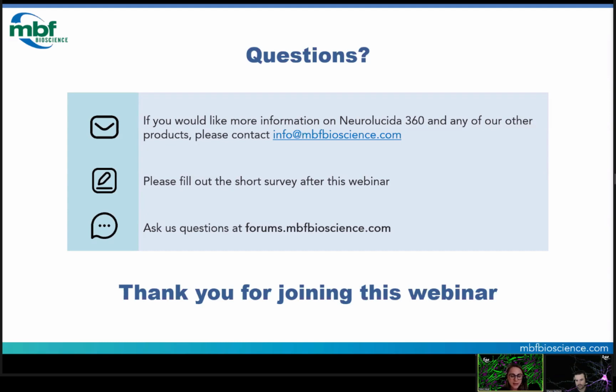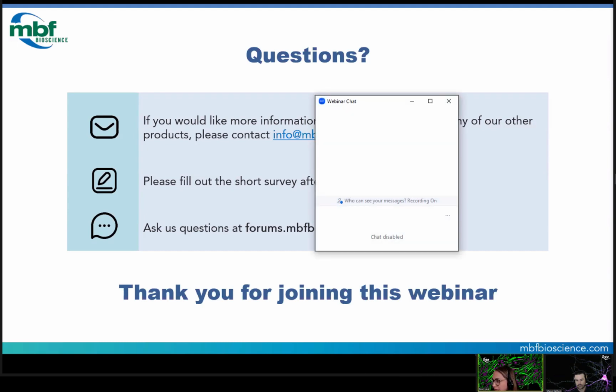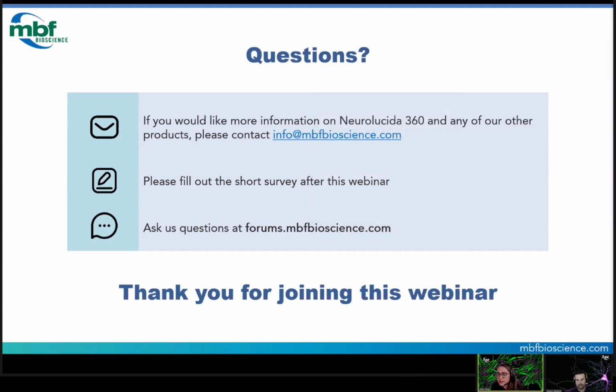There are ways you can, and this actually ties into another question we have of, can you edit the reconstruction after it's run through the batch pipeline? And the answer is yes. So you can go in, take one of the XML files that Shane, you showed in Neurolucida Explorer, bring that into Neurolucida 360. Before you go to analyze, just make sure the tracing is accurate. You can edit it point by point. You can use the semi-automatic tracing functions to clean up anything that was missed.